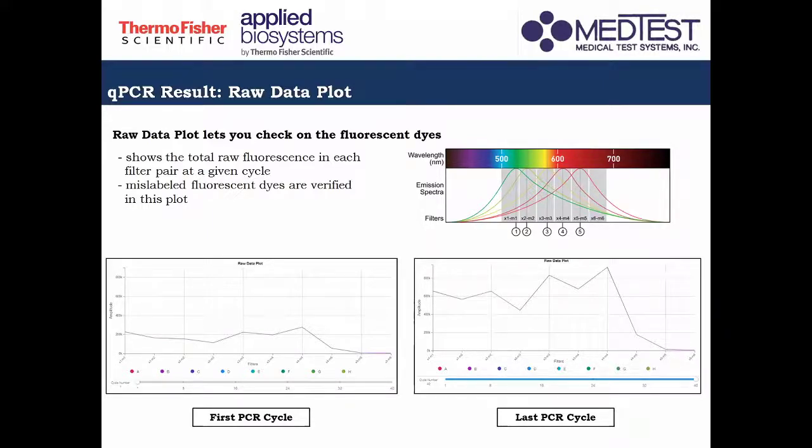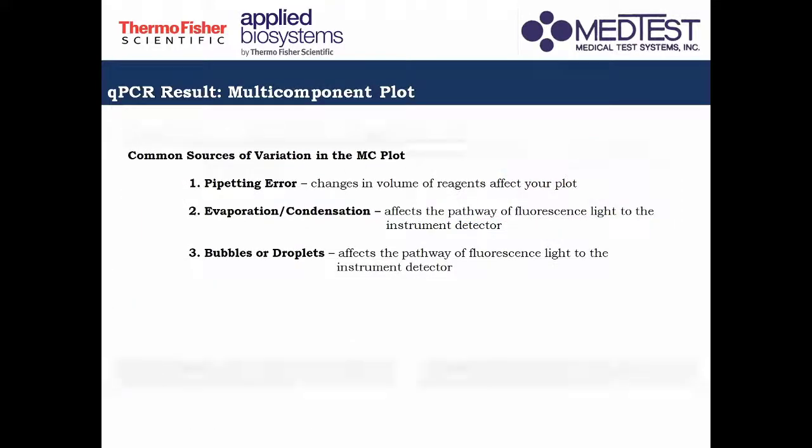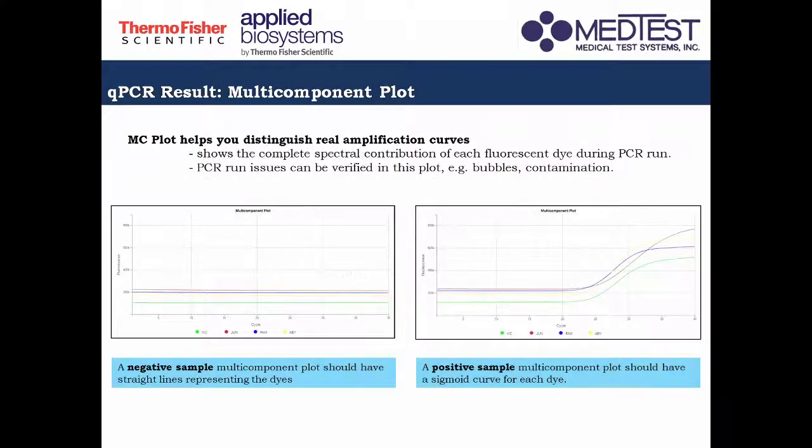No worries, sir. I think you can also gain this based on experience as well. So pag meron na kayong mga samples talaga sa lab nyo, then you repeatedly analyze the plots, then you will be able to really understand it. But for now, you can rely on the automated baselining and threshold of the software. Kasi maganda talaga siya. Okay.